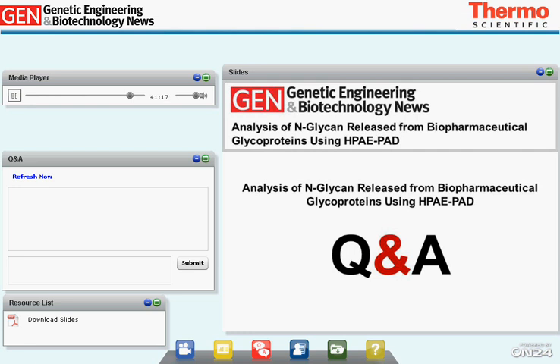Okay, Sebastian, how long does it take to set up an HPAE-PAD system for N-glycan analysis? I would guess it takes about 3 to 6 months. It depends on the background, the equipment of the laboratory. But if you have one responsible person who can set up all the system to get the samples running compared to reference standards, 3 to 6 months should be the time you need for the setup of the system.